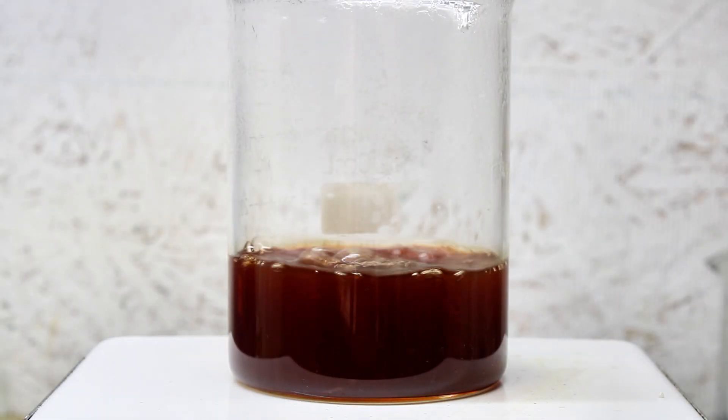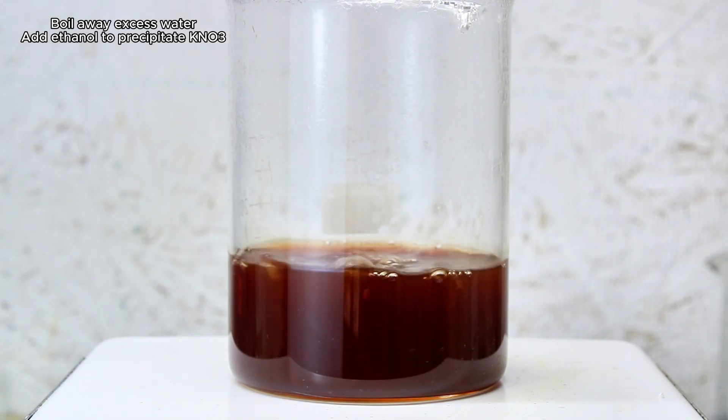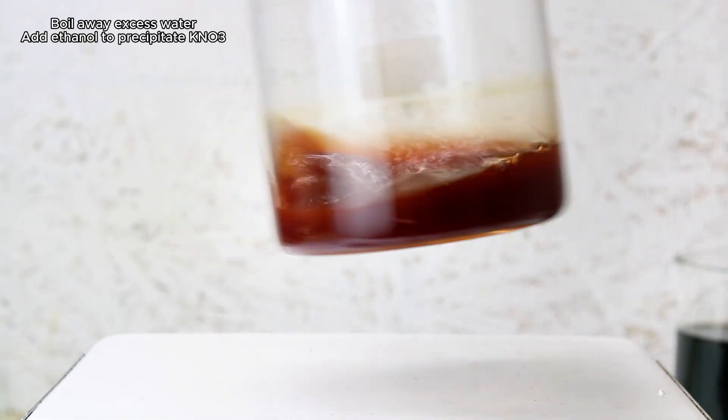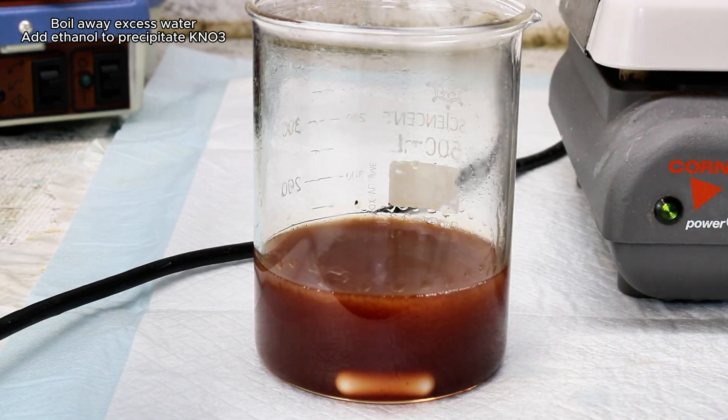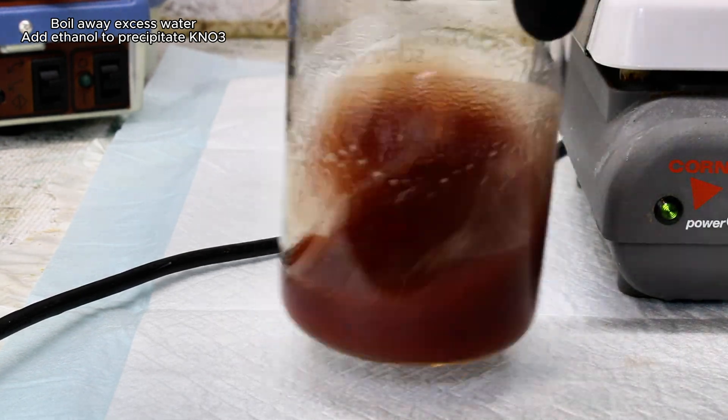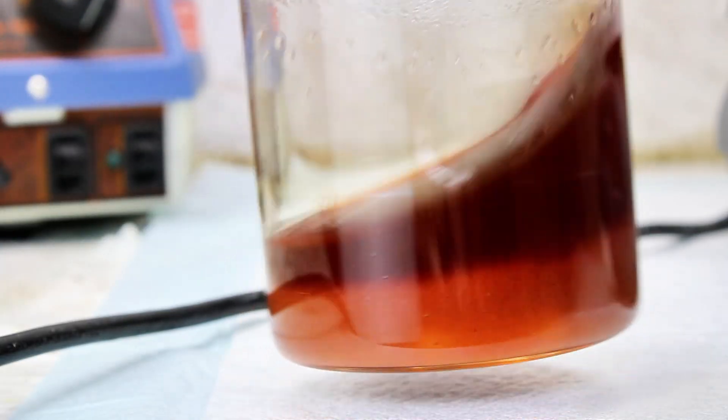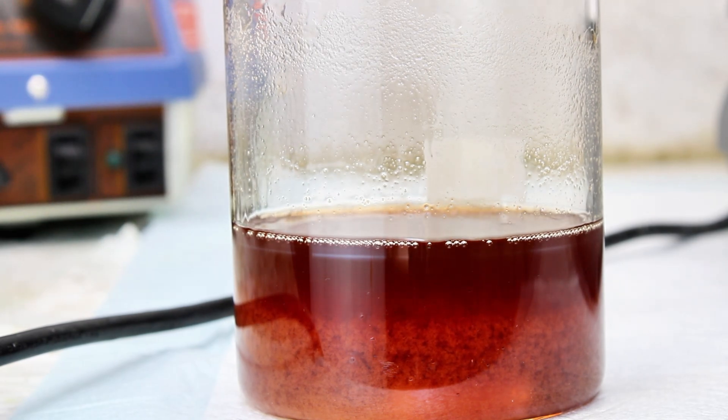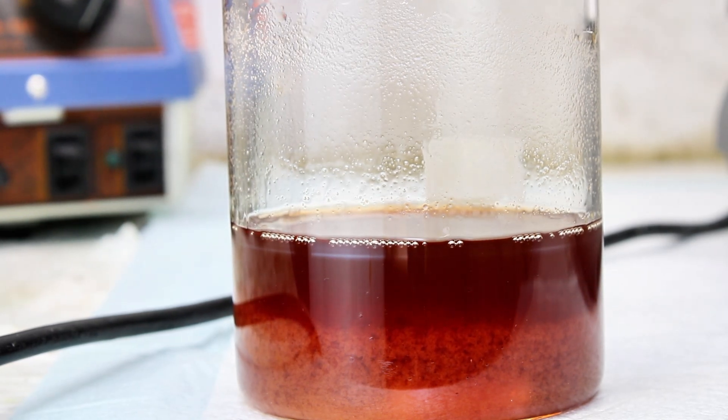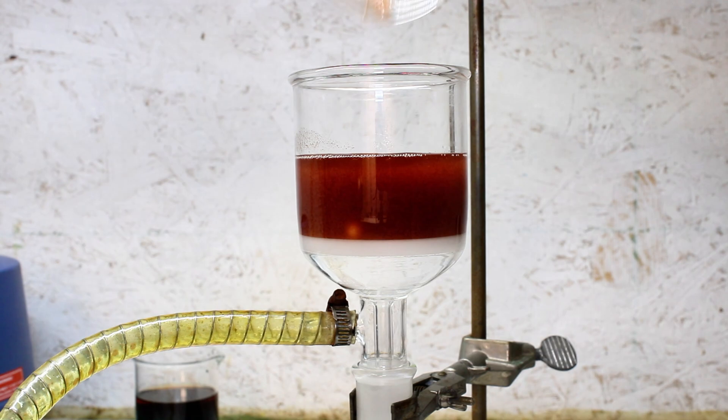The sodium nitroprusside solution was then boiled down to around a fifth of its initial volume, and then I added an arbitrary amount of absolute ethanol to try and precipitate any remaining potassium or sodium nitrate. This was allowed to cool down to zero degrees Celsius, and then vacuum filtered, and the filtrate was then subsequently boiled down again to crystallize the sodium nitroprusside.